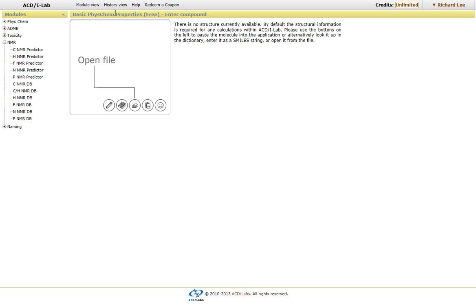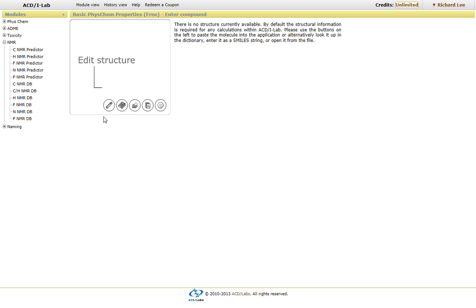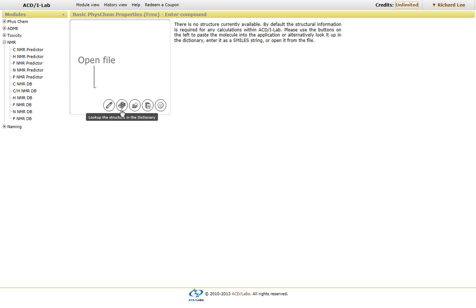we have our structure interface, where we can either draw in the structure, use our ACD Labs dictionary, which has over 160,000 names.